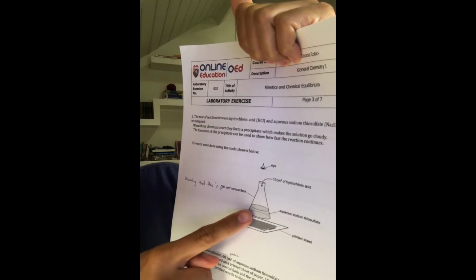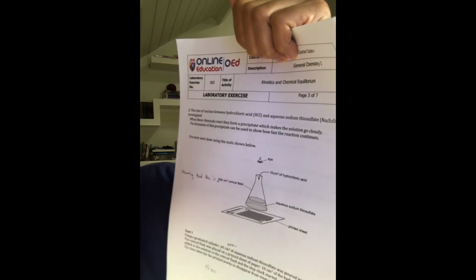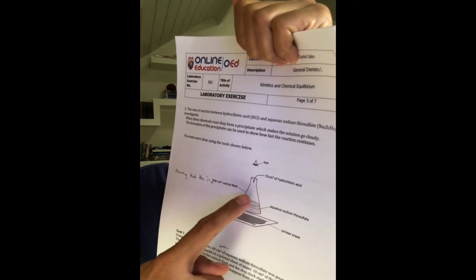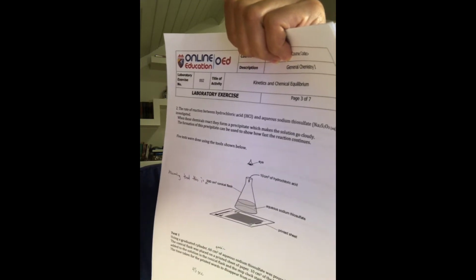Assuming that this is a 500 cubic centimeter conical flask, and this is your printed sheet, and this is your aqueous sodium thiosulfate, and you'll put 10 cubic centimeter of hydrochloric acid on it.